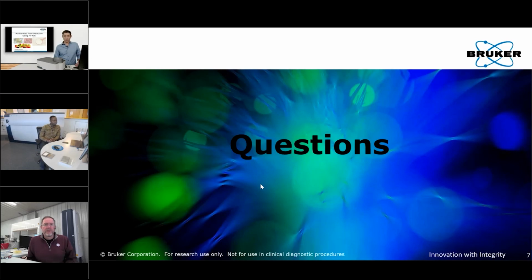Good. And I would just make a comment from the side of MALDI. MALDI is not well suited for quantification on a milligram per gram basis, but there are applications where we can look at relative quantification of identified compounds. So it's semi-quantitative if we understand the behavior of the ions in relation to the other compounds that are present. Estimating relative A to B type interflavan linkages is a semi-quantitative but very accurate and precise way of characterizing that polymer distribution.